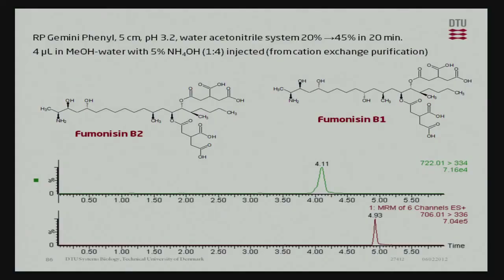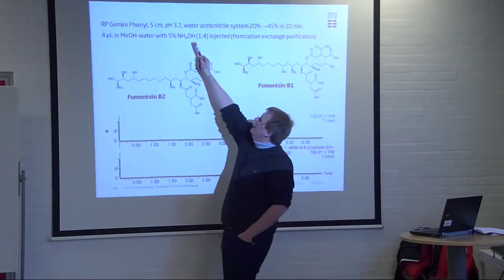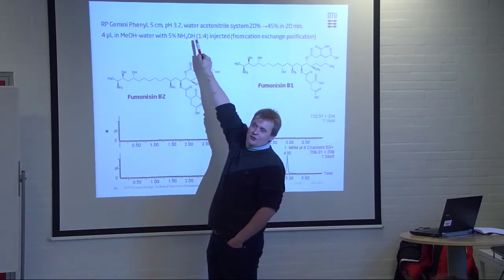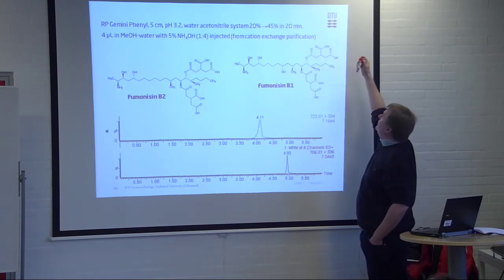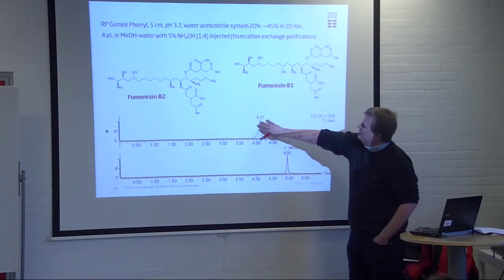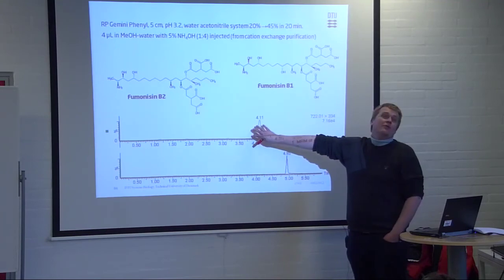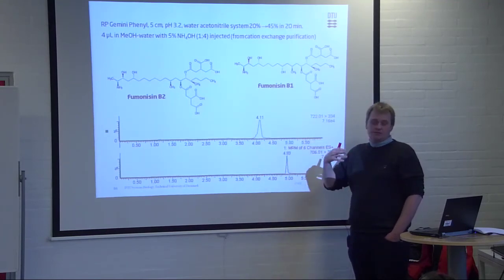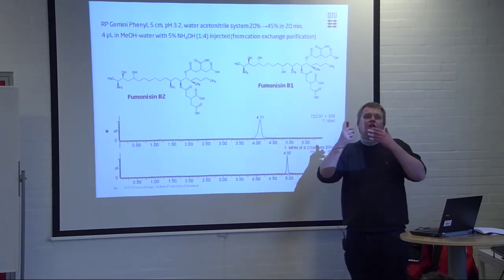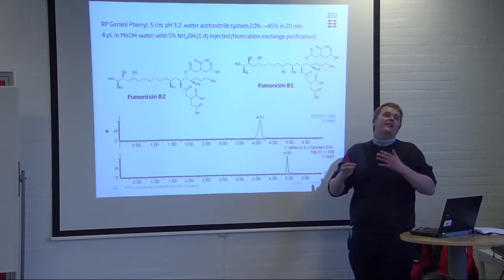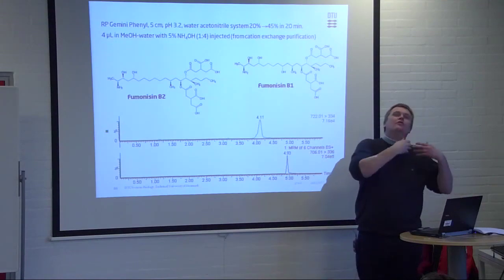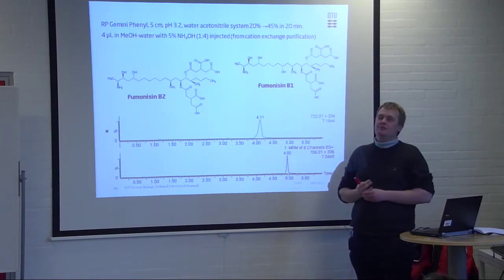Also, pH. So, we recall these are the fumonisins we talked about. So, if we have them in ammonium hydroxide, pH 11 or 12, and we inject a lot, then we also have a problem. And this is why these two isomers, the first isomer is much more broader. So, also, if you have a very different pH, that will make your analyte more polar, you also perhaps have to change the pH of the sample.